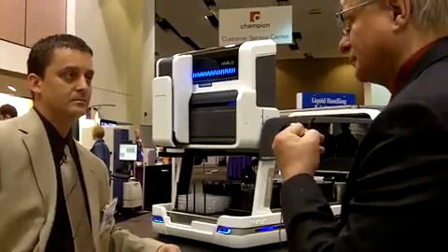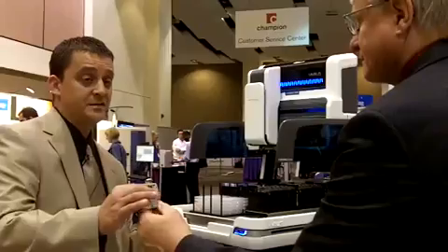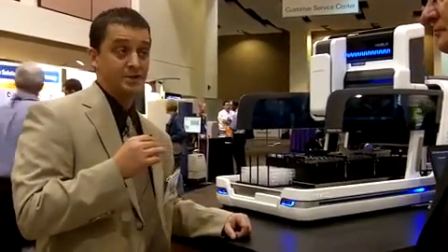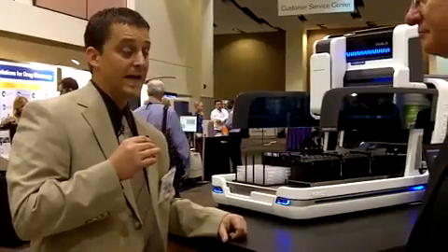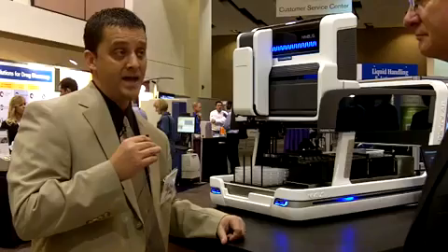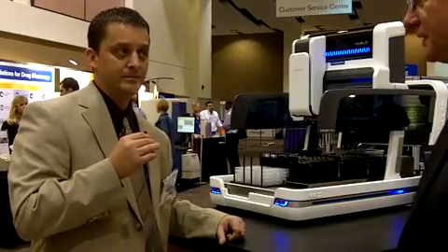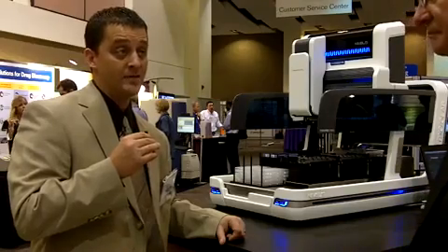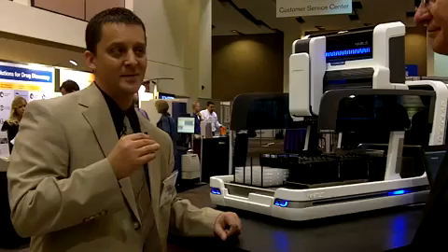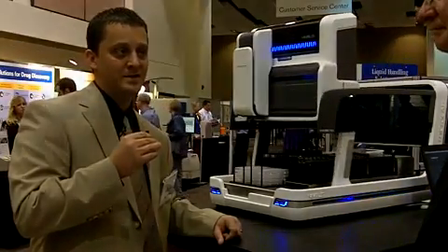Are you producing and shipping this now or in the future? Right now this is the first public showing here at Lab Automation, so it's not in production yet. The plan is to do a formal commercial release around May or June — sometime in the late spring to early summer time frame of 2010 — and ship at that time. We've had a lot of interest at the show, and we're looking forward to launching this in a few months.